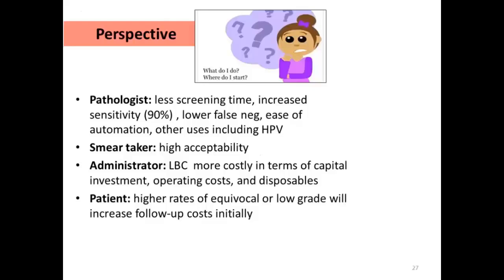Smear takers were also very happy. In their busy clinics, they didn't have time to spread the smear on the slide and fix it quickly. Even the training of these smear takers could not help improve the smear quality. So this burden was taken off their shoulders, and it achieved high acceptability among sample providers. However, from the administrator's point of view, it is definitely more costly in terms of initial capital investment, and then running costs, disposables and reagents, because it is all very customized, so we cannot use other material for these machines.